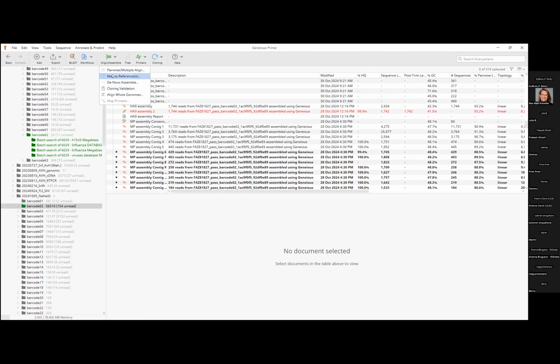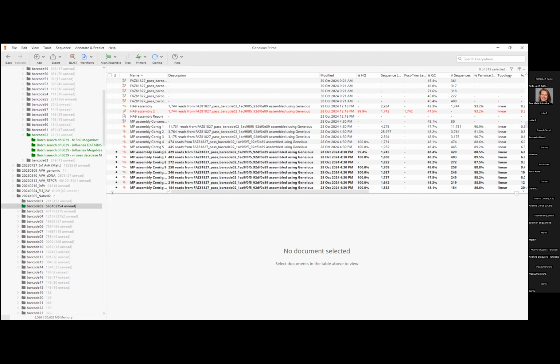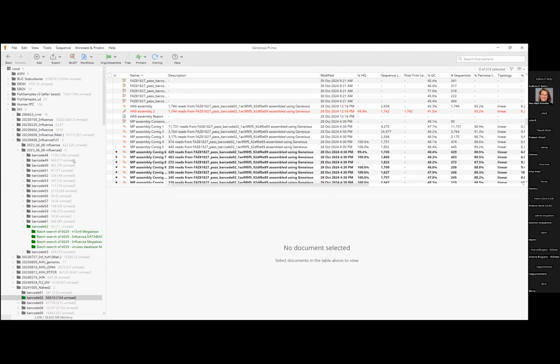As I mentioned, you can use all kinds of different things. As you can see here, you can just, let's say, play. It's your playground as a scientist to play with your data according to your needs, according to what you're looking for. Very handy. There's tons of posts and YouTube tutorials that you can use. Yeah, very easy to use. We use it regularly. I really like it. Once you get into the whole flow of the interface, you can just go ahead and play.